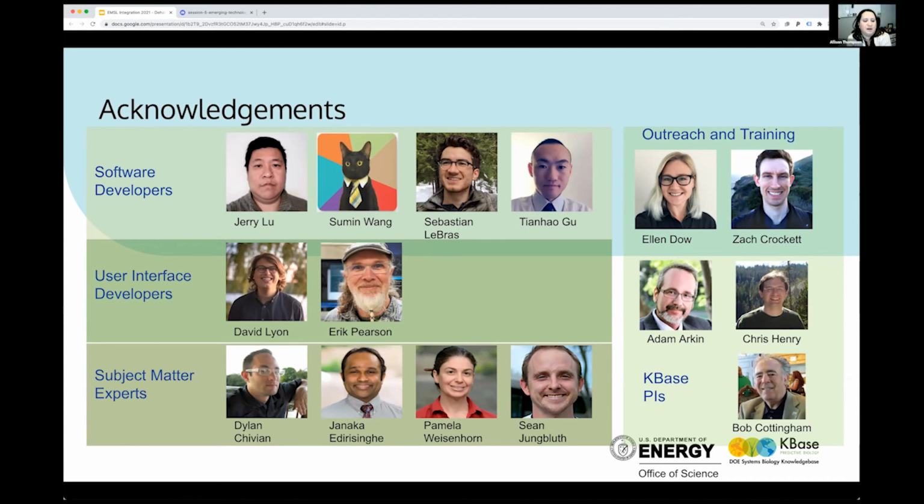Awesome. Do you have a standard sample process that you could recommend that minimizes the degradation of the sample when exposed to light and oxygen? So this is the thing with KBase: we don't really make a lot of recommendations on how to generate the data. What we're trying to do is capture how others have been processing the data, the protocols that they use.